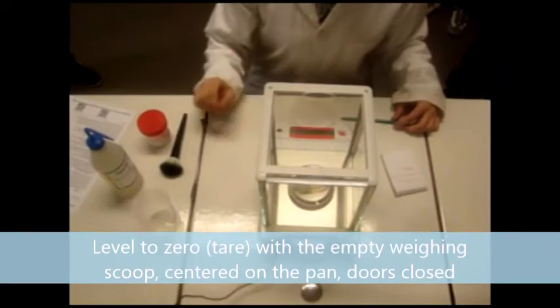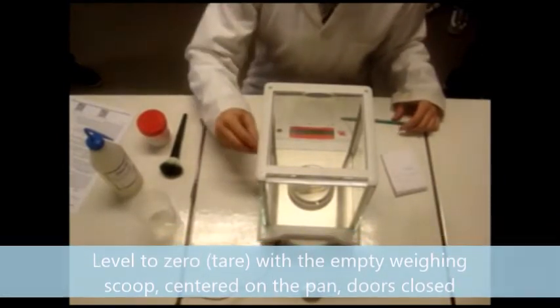Level to zero, start with the empty weighting scoop, place it on the pan, door closed.